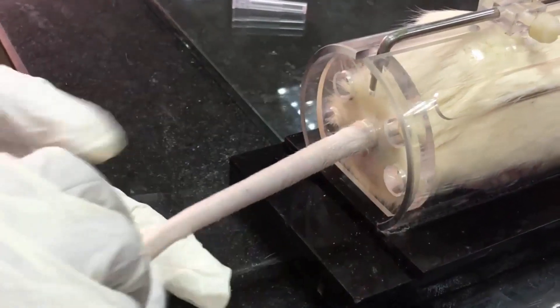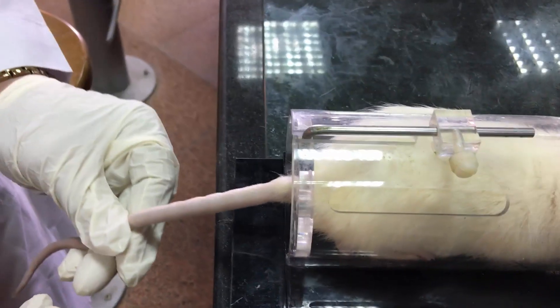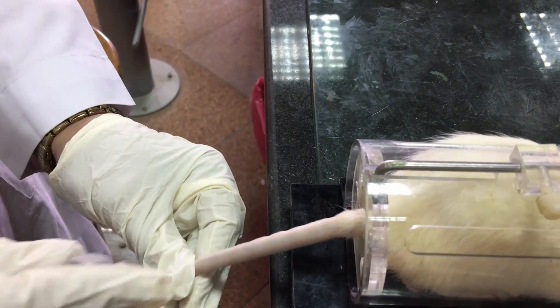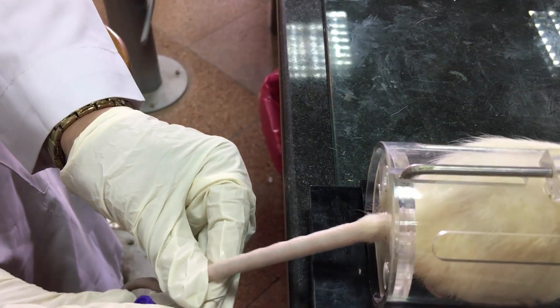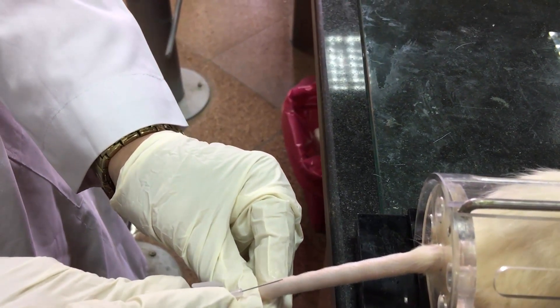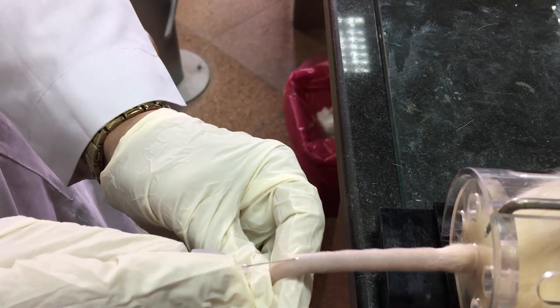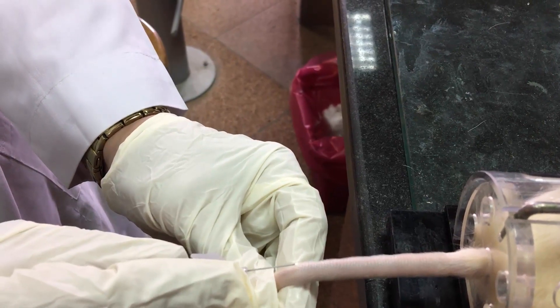Apply finger pressure 5 cm from the tail tip to enhance the visibility of the tail vein. The lateral tail vein is accessed one third from the tail tip. Insert the butterfly needle or cannula needle to collect blood.